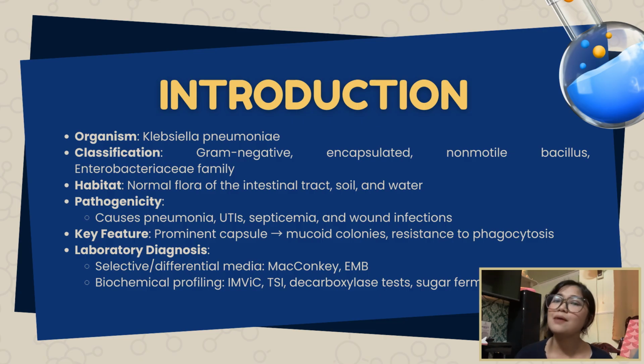Its most distinctive feature is its capsule, which makes the colonies appear mucoid and helps the organisms resist phagocytosis. In the laboratory, K. pneumoniae can be identified using selective and differential media such as MacConkey and EMB agar, and through biochemical profiling including IMViC, TSI, and sugar fermentation tests.